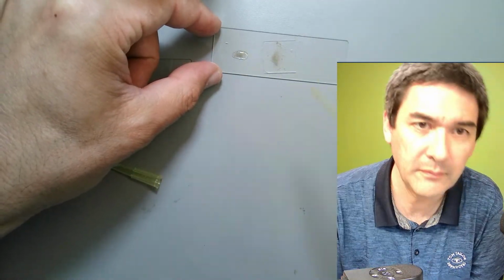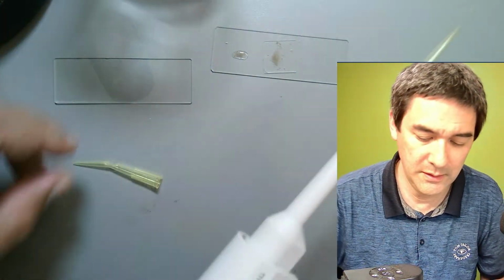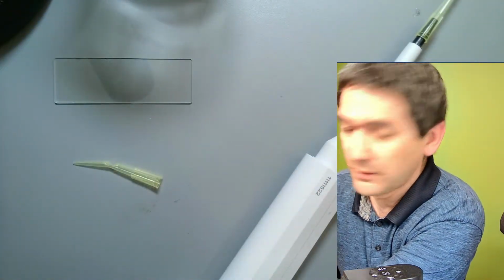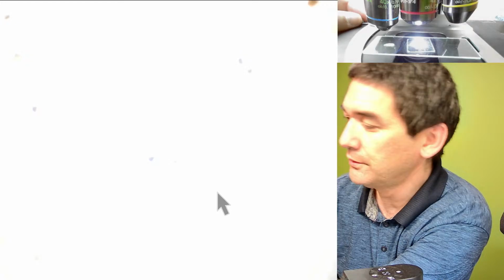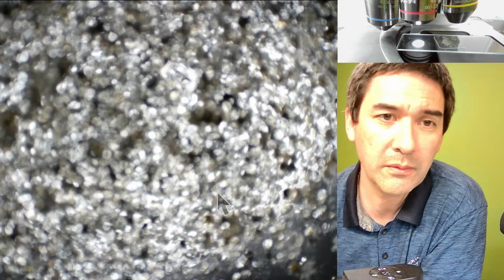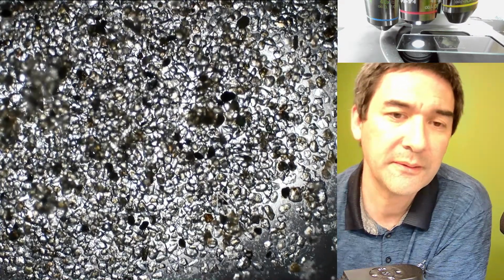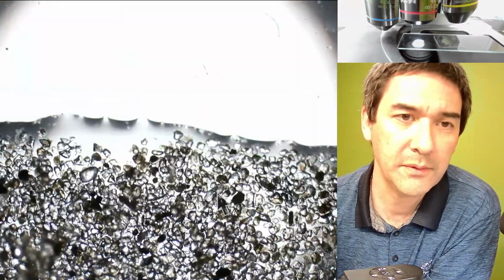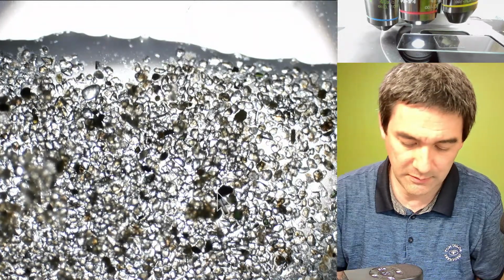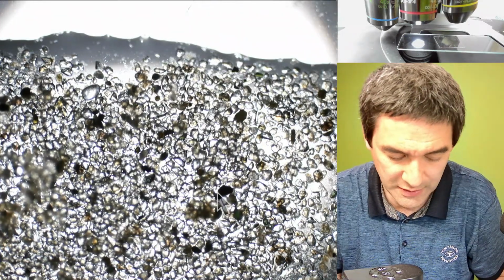And let's go back again to the microscope view. This only works with a low power, obviously. Way too dense. You see, this is kind of the droplet, and I don't know if this actually works now.